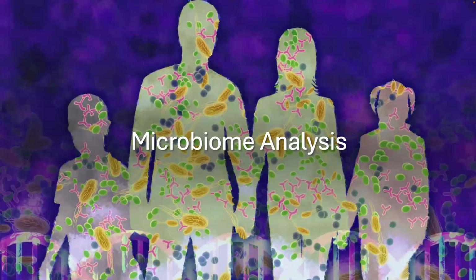If you are new to microbiome research or bioinformatics, don't worry. This training module provides step-by-step guidance to help you navigate the process. Microbiome science is a rapidly growing field, and learning how to analyze sequencing data is an invaluable skill for researchers across disciplines. By the end of this module, you'll have an understanding of microbiome research, how to analyze and explore these data sets, and how to interpret diversity plots. Let's get started.